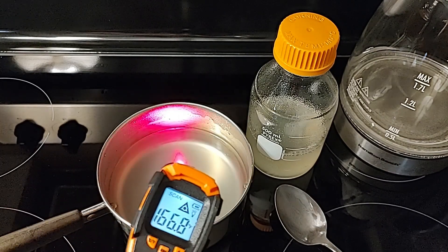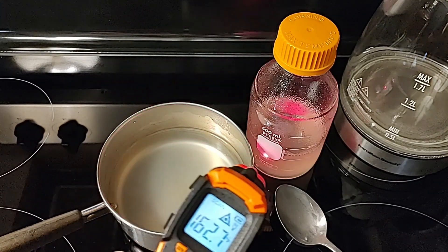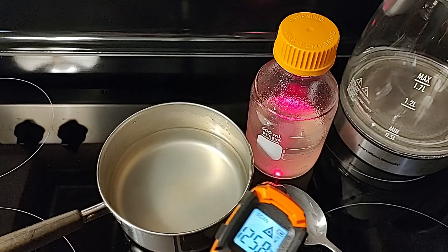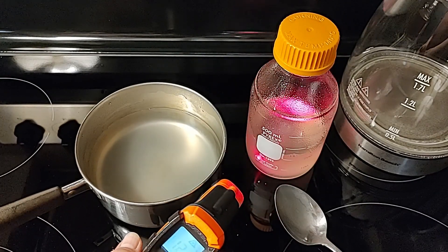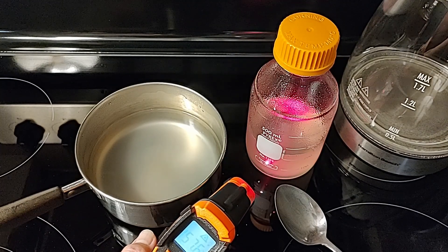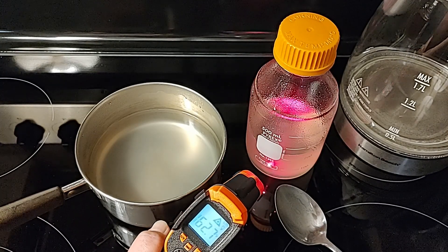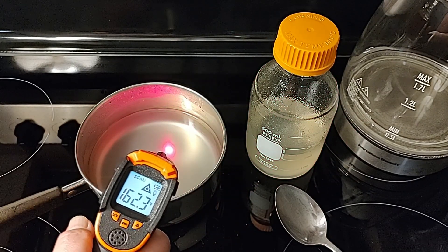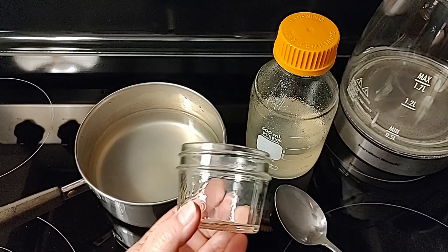Let's get a temperature on this — it's going to be in the 160s, and it cools quickly. I recommend that if you're going to be pouring to no-pour jars, make sure you get them poured before it cools below 140 degrees. So don't wait — as soon as it's ready, go ahead and start pouring your jars.